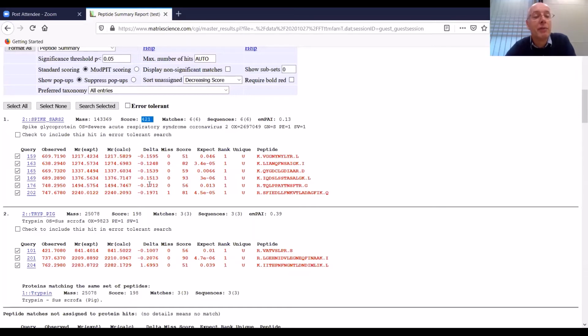You have to take off the effect of the database. So the database is large. The database is about 600,000 entries, but even taking that into account, that will still give you a p-value of 10 to the minus 36th power. So it's still massively significant.